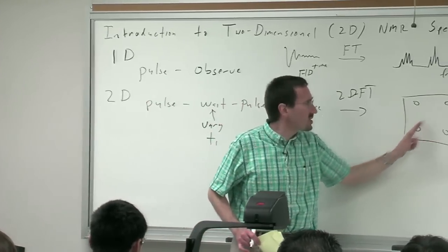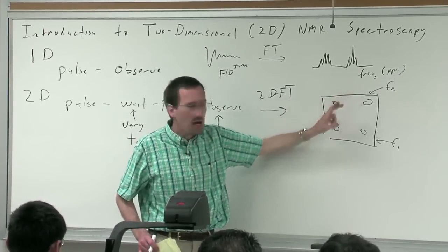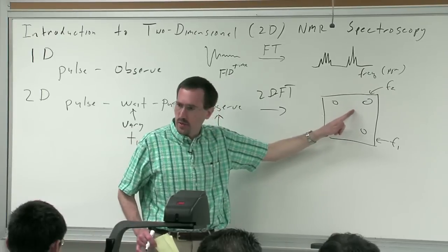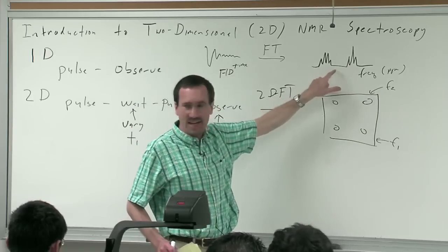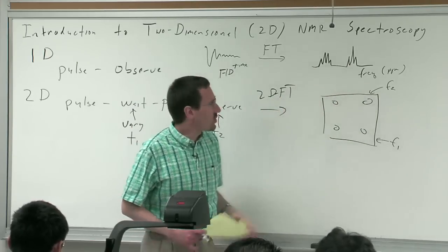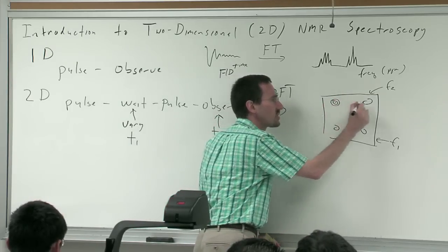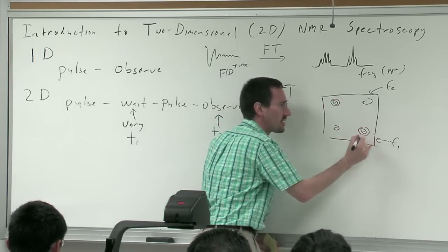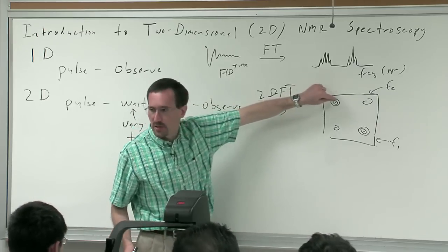And so you get a spectrum now that consists of 2 frequency domains. It is, of course, plotted 2-dimensionally, but just as this is actually a 2D graph, this is a 3D graph, if you will. And typically these days, the way we express it is that it's a topological map. So you'll typically see a series of contours.